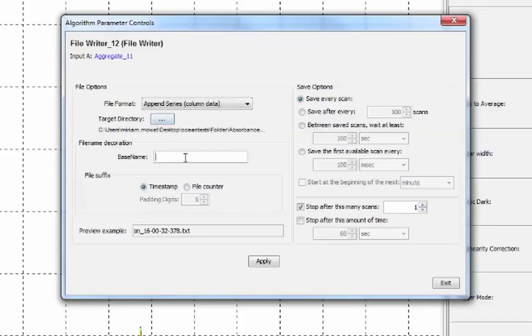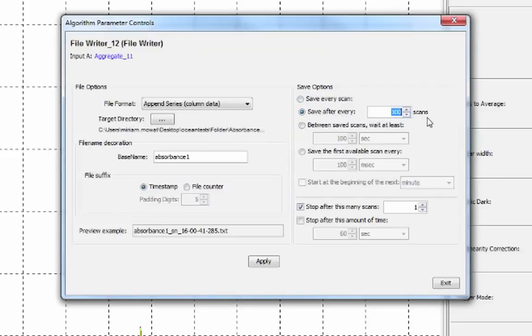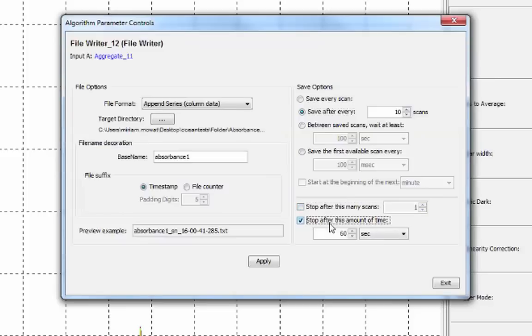Give the files a base name and choose from various other saving options, including how often you want to save a scan and how long you want saving to go on for. Click apply and exit once you've chosen these.